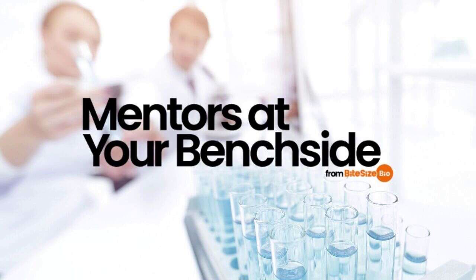Number 2, copy number. If the genes are cloned into different vectors, then the issue could be that the plasmids are replicating at different rates. One may be a high copy plasmid, and another may be a medium or even low copy plasmid. Some examples of low copy plasmids are those using the backbone pBR322 and pACYC, which are older and not used often in cloning work today. Many vectors used for protein expression are medium copy. This is desirable because when producing proteins, sometimes if growth is too fast, it increases the chance of the protein becoming insoluble or forming inclusion bodies.